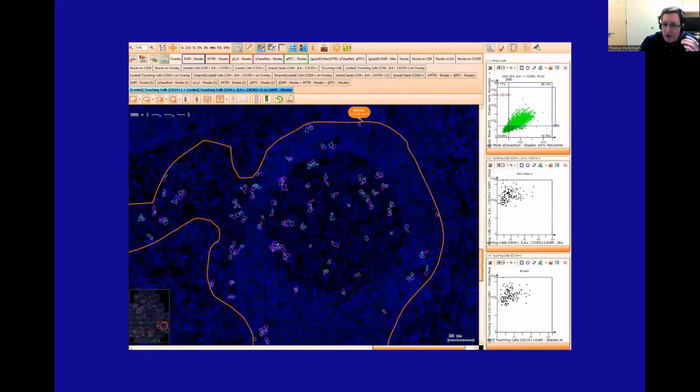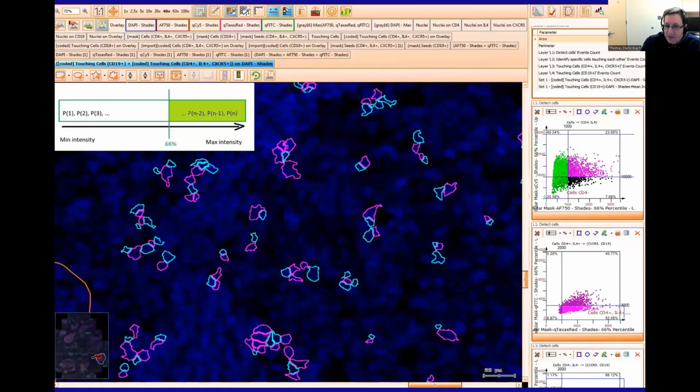So just shown superimposed on the DAPI channel by itself. So these are the cells that are in contact with each other. So we can map that out. And this is just a close-up showing those cells. And it utilizes basically an overlap of 3 pixels between the borders of the cells and then a 66th percentile algorithm to positively correlate their association in space.